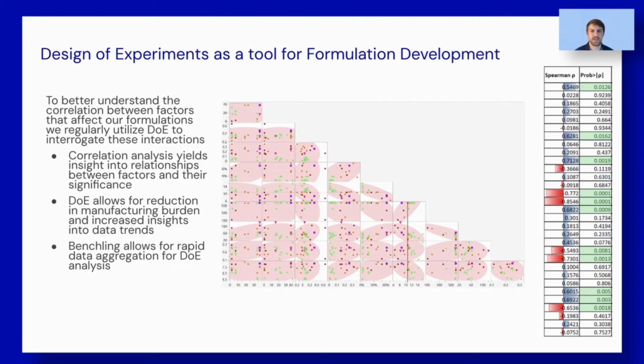Briefly, design of experiments is essentially applied statistics that deals with planning, conducting, analyzing, and interpreting controlled tests to evaluate factors that describe the value of parameters or groups of parameters. In so doing, DOE gives us two powerful tools. Firstly, it defines and often reduces the number of samples, in this case formulations, that need to be tested. And it also helps by showing trends between variables, also including so-called higher order relationships that are often difficult to observe and quantify normally, such as logarithmic or polynomial relationships. Here I have an example of experimental outputs that we were able to produce taking a DOE approach.